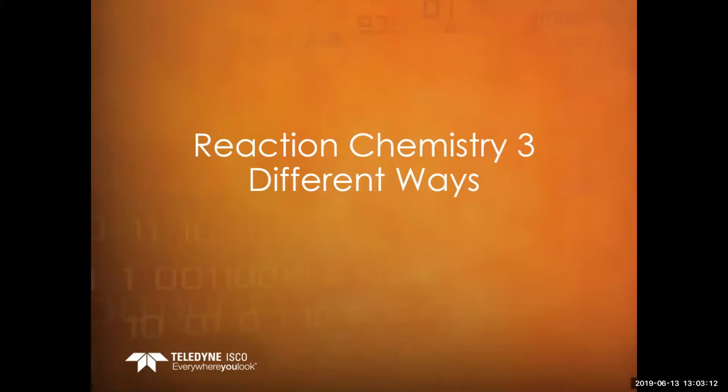Thanks for attending. We're going to talk today a little bit about reaction chemistry in a few different ways, and what that really is going to focus on is three different types of pumping technology that you can use in the reaction chemistry world.